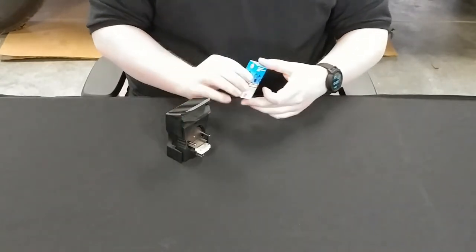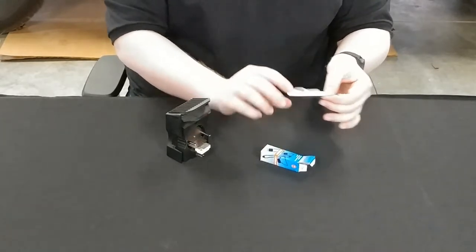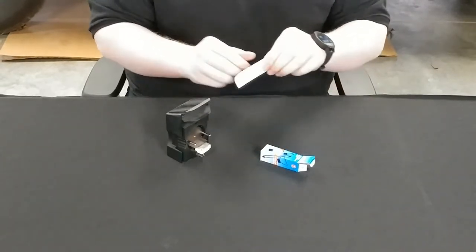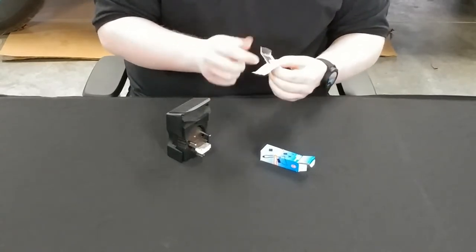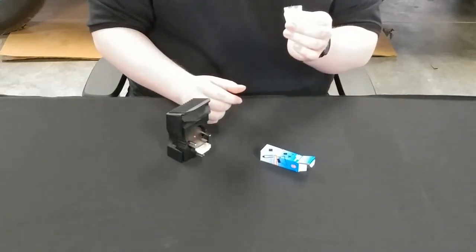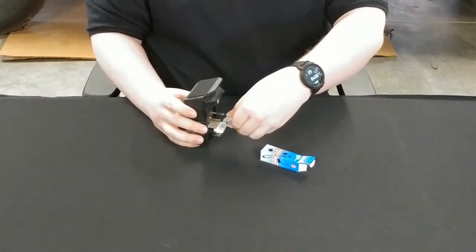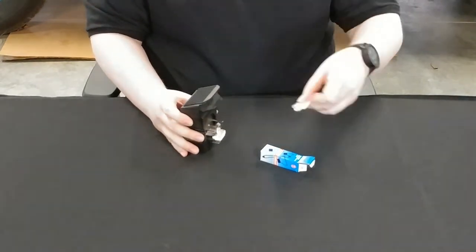Now we're going to put the new bulb in. Simply open the box and take out the new bulb. Note it's in a protective sleeve — this is going to help you install it. Go ahead and open the sleeve halfway, exposing the two metal prongs at the bottom of the bulb. You're not going to want to touch the bulb because the grease from your fingers can reduce the lifespan of the bulb. Now simply take it, align the prongs with the socket, push in firmly, and remove the plastic.